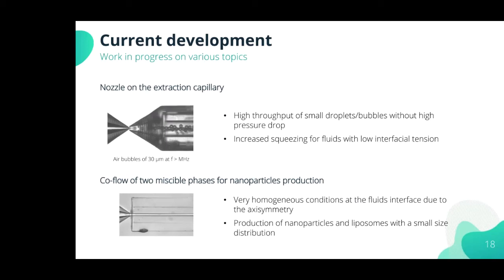Can we use the Raydrop sizer with a PDMS device? The answer is no, because the model is only for the Raydrop. Actually, the geometry is totally different, so you definitely can't use it for a PDMS device.